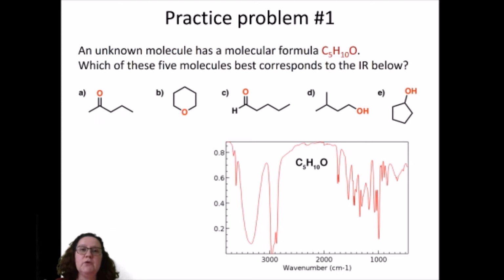In this video, we're going to be practicing interpreting infrared spectra. I'm going to stop the video several times and ask you to do the problems, and I would really encourage you to stop the video and have a go at the problems before I solve them.